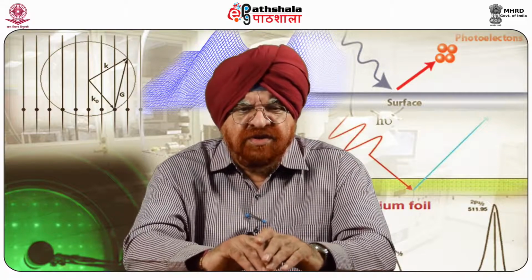So, therefore, it can be summarized as follows: the magnetic force microscopy image of an isolated submicrometer structure present in the SiMn 20% film after thermal annealing at 600 degrees centigrade is checked.